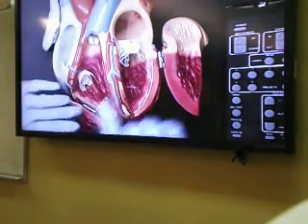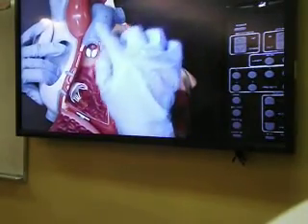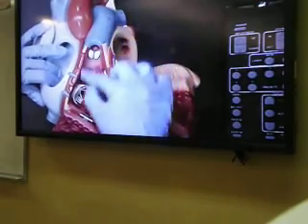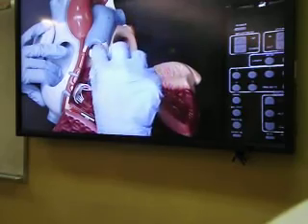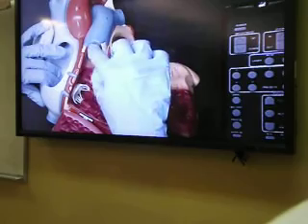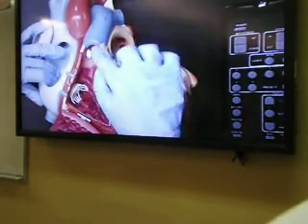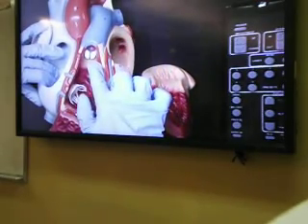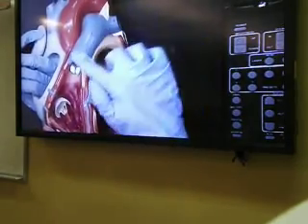At the same time, this valve, which you are seeing right over by this pipe-like structure, between this pipe-like structure and the right ventricle, which has 3 cusps but half-moon shaped cusps, will be opening up. And we call this valve the pulmonary semilunar valve. The pulmonary semilunar valve opens up so that deoxygenated blood goes via the pulmonary semilunar valve into this blood vessel.